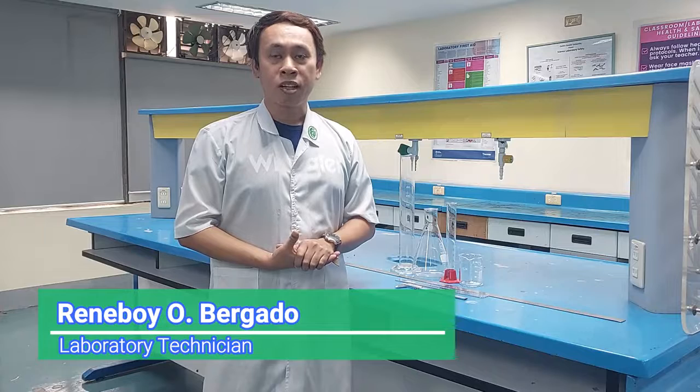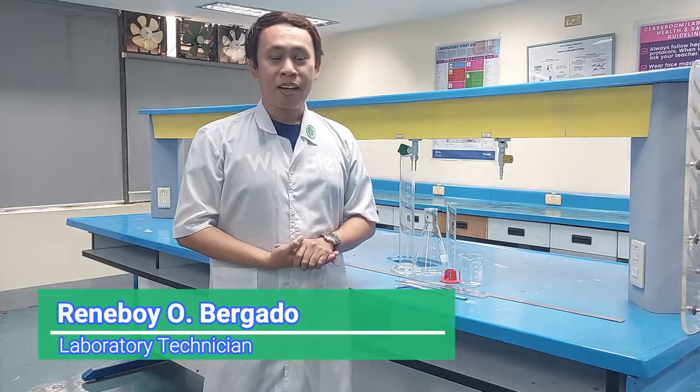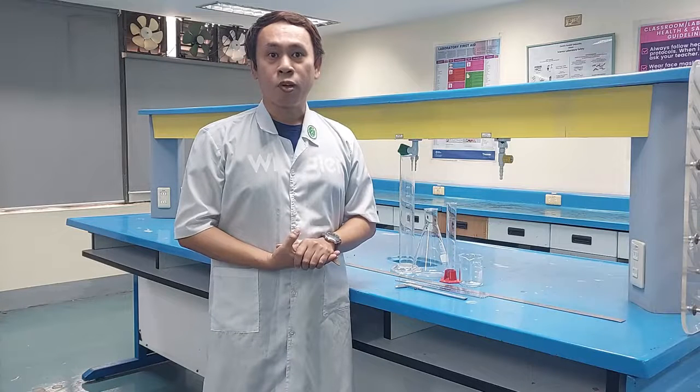Good day, mates. For today's segment, we're going to discuss scientific measurement techniques. A key component of most scientific investigations is measurement. By using a common system of units of measurement and by making precise and accurate measurements, scientists ensure that procedures and results can be reported and repeated anywhere in the world.